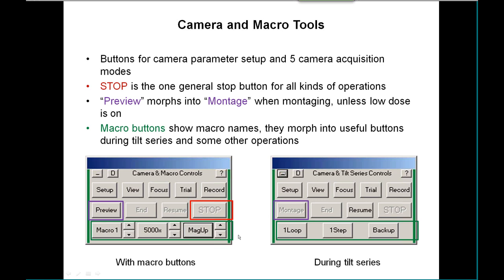A very important panel is the camera and macro controls. It has buttons for starting the camera parameter setup dialog, which we'll come to in a moment, and five buttons for the five different camera acquisition modes that all have independent parameters.